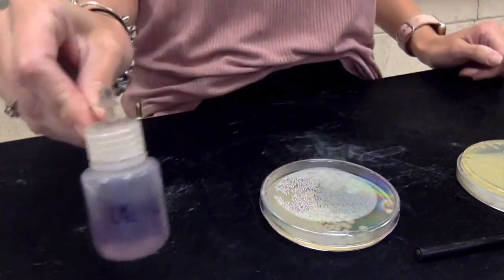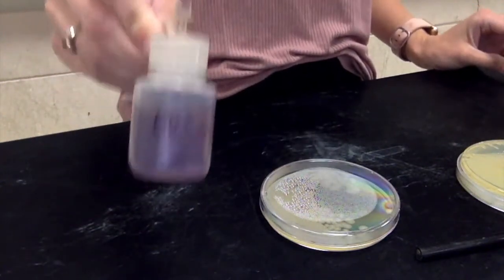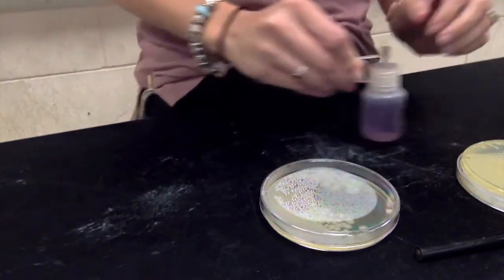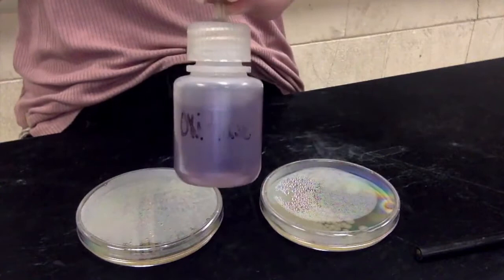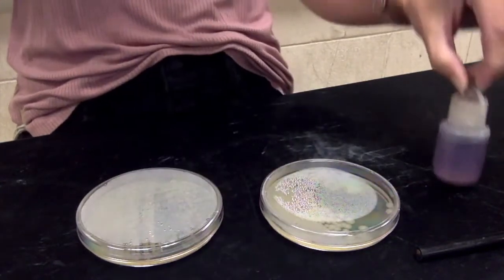Next is the oxidase test. Remember, this is testing to see if the bacteria produces that enzyme that turns the oxygen into water. Okay? So to do this test, I'm using an oxidase reagent. I'm not going to tell you what it actually is because it's a really, really long word and y'all don't need to know that. All you need to know is it's the oxidase reagent.